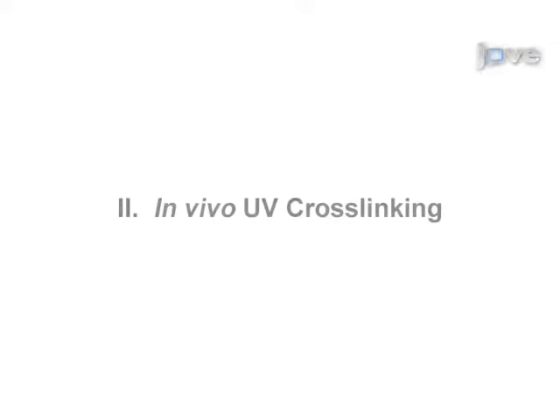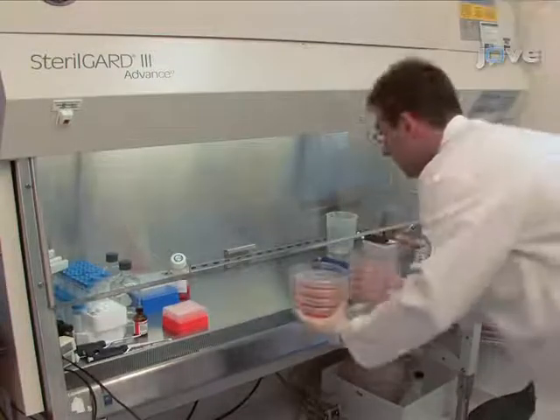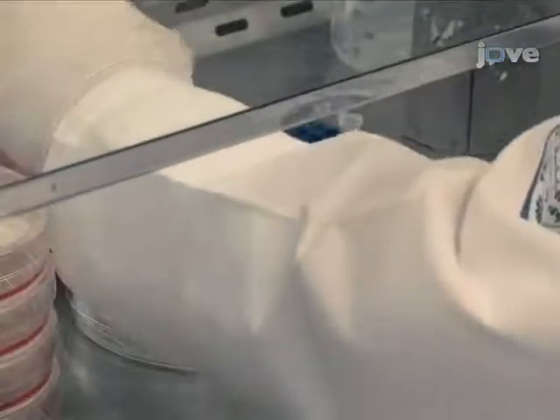Okay, so let's get started. In vivo UV cross-linking begins in a laminar flow hood. In this protocol, we will use tagged IGF-2-BP1 cells as an exemplary model.